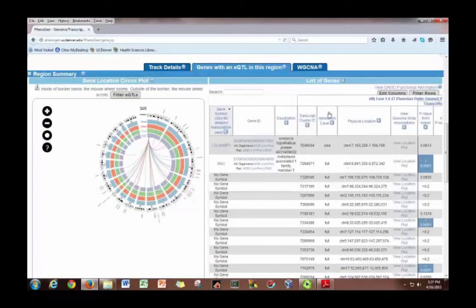How many people have worked with an exon array before? Nobody? So regarding the annotation level over here, let me give you a brief introduction. The exon array is huge, right? It has 1 million probe sets on it. It's probing not only known genes and known transcripts, but also computationally predicted regions. Somebody thinks there might be an open reading frame, so let's put a probe set down in this area.